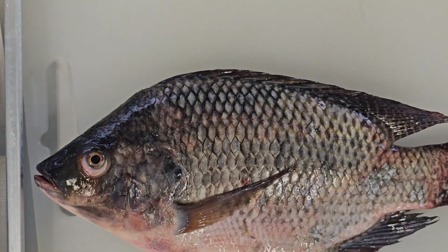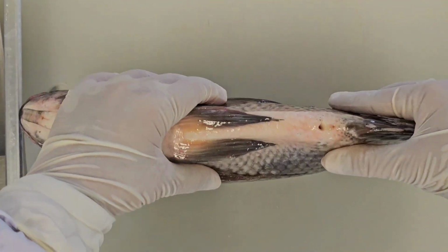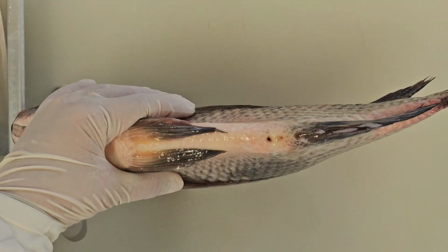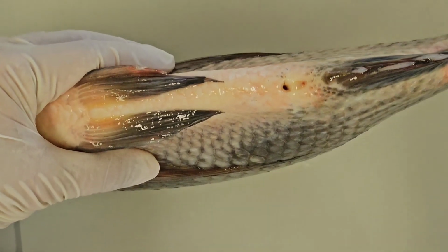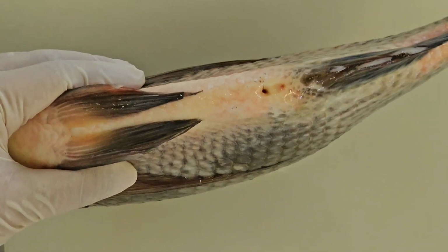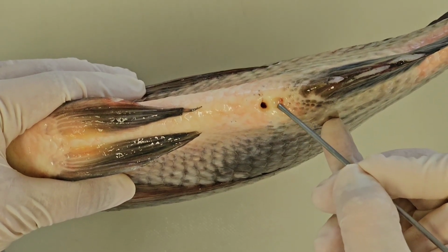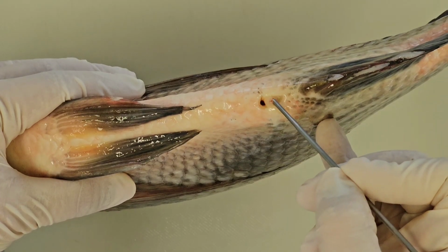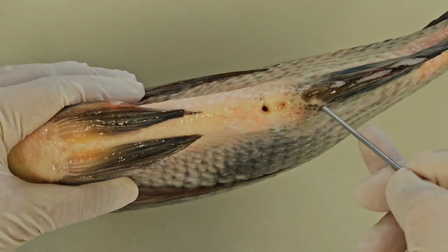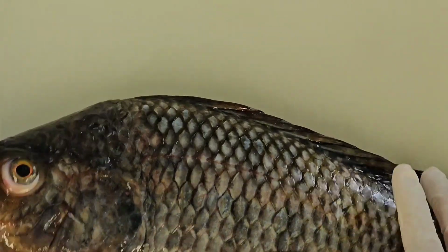And if you look at the ventral part of the body, you can see that it has two opening pores. The first pore, located at the frontal part, is the anus. So you can see this pore is the anus. And the next one is the pore called the urogenital opening. This one is the opening of the reproductive and urinary systems. It has a papilla at the opening of the pore.